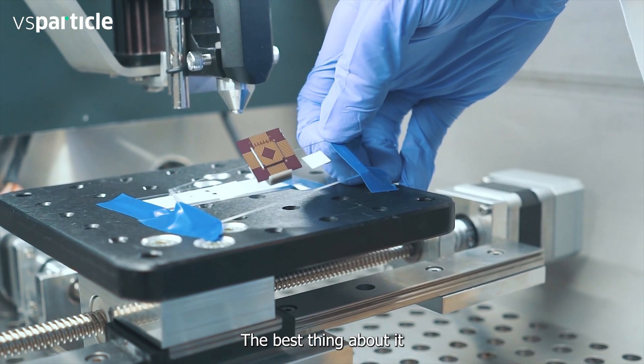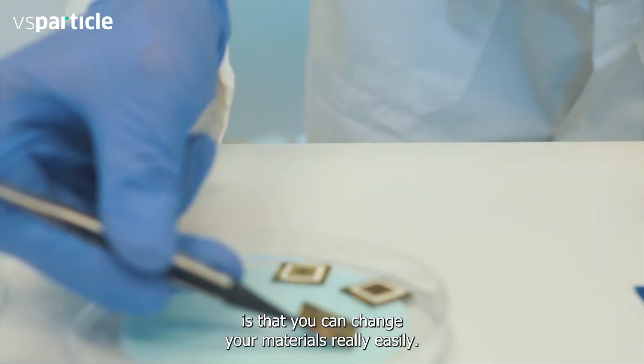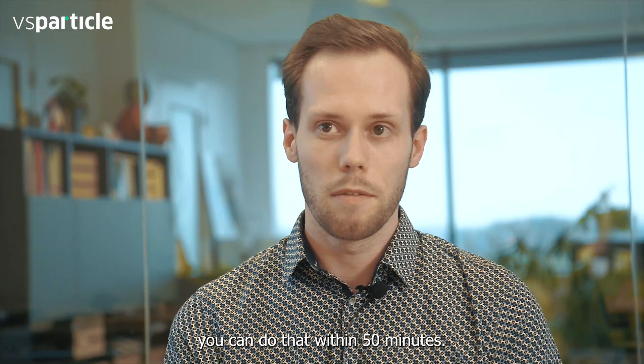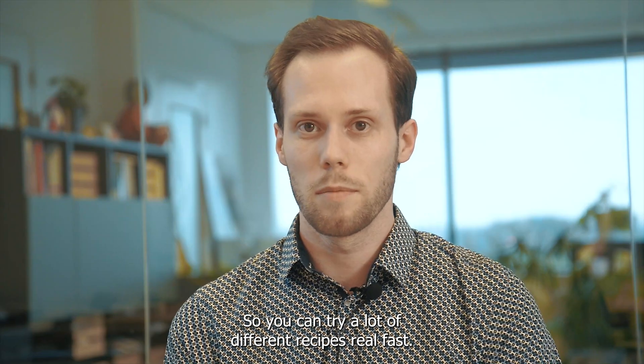The best thing about it is that you can change your materials really easily. If you say I want to use platinum instead of gold or silver, you can do that within 15 minutes, so you can try a lot of different recipes real fast.